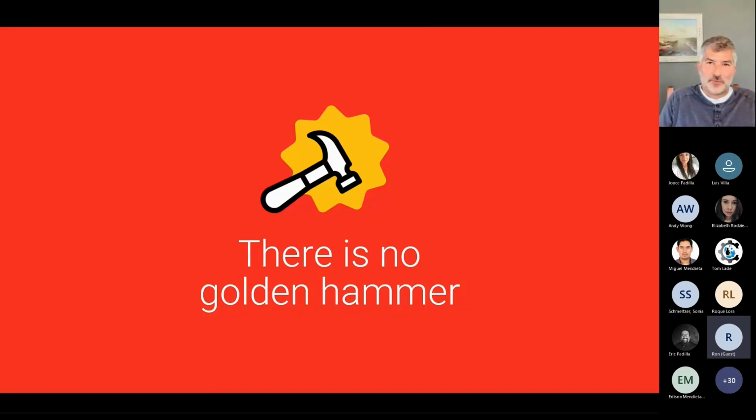The problem is this is what I've also seen companies do, because they will take their one LIMS system and they will find a way to mash every problem into it. So then they customize it beyond its intended customization level. Now you can't leave that system. Migrations or even upgrades of that existing system then become cost prohibitive and you are stuck on a system that you can't move forward with.